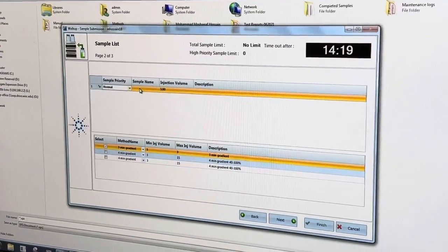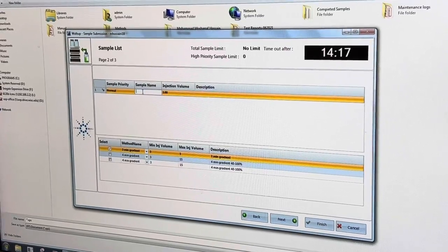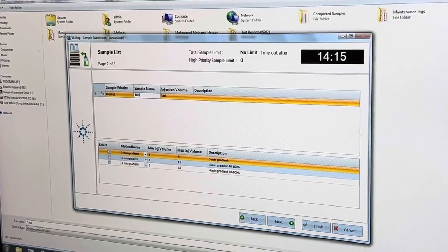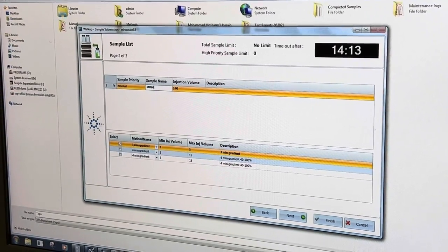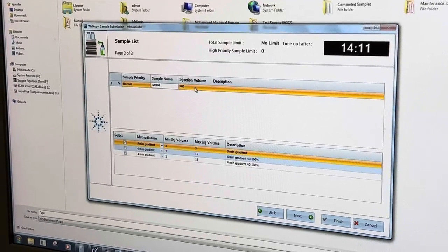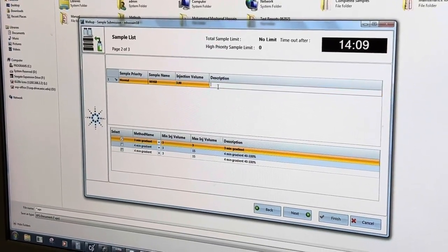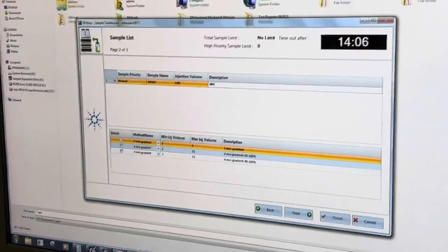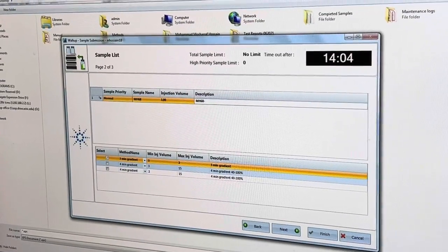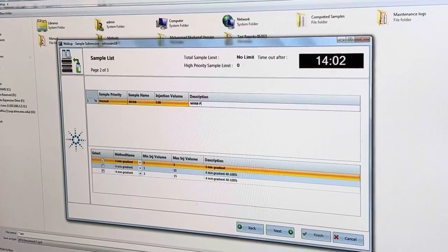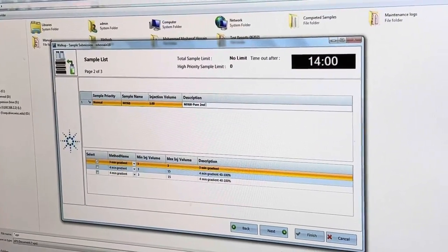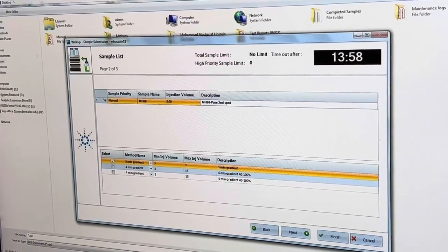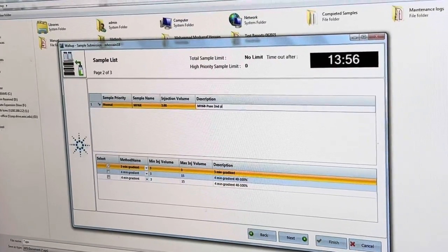And here the sample name you have to put the name like maybe this, and injection volume three, description you can put whatever.